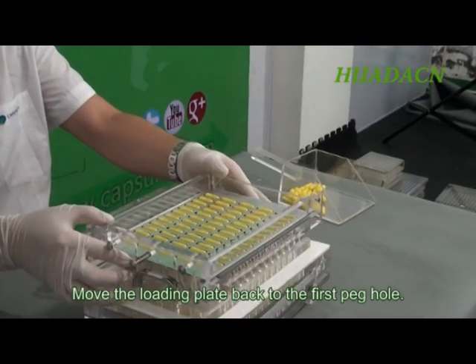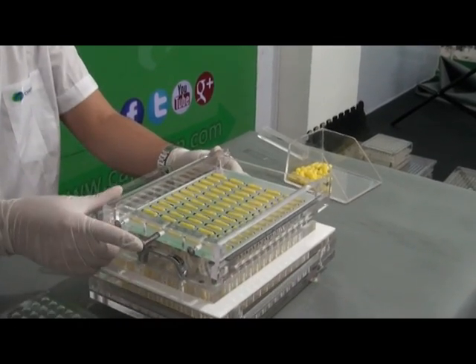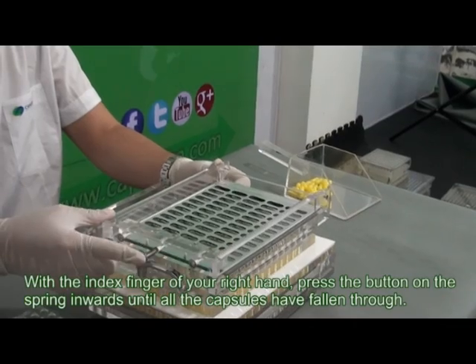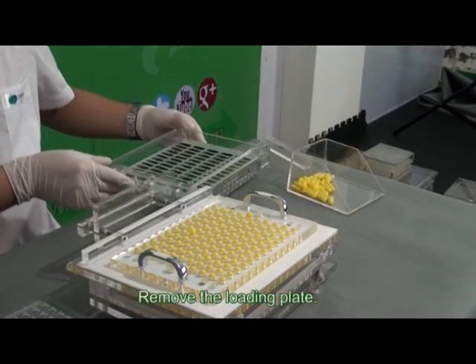Move the loading plate back to the first peg hole. With the index finger of your right hand, press the button on the spring inwards until all the capsules have fallen through. Remove the loading plate.